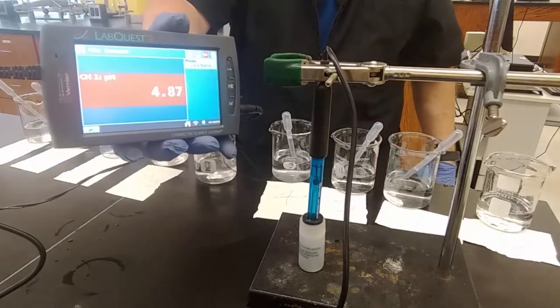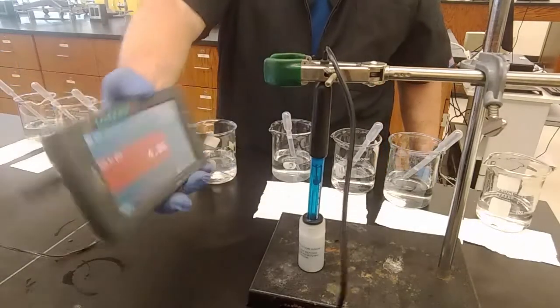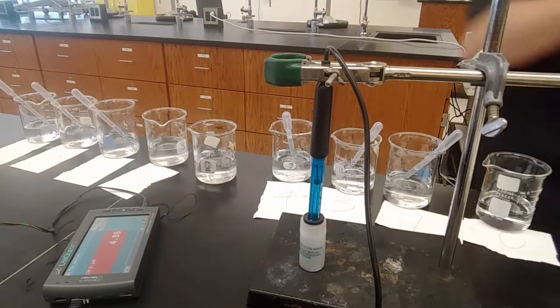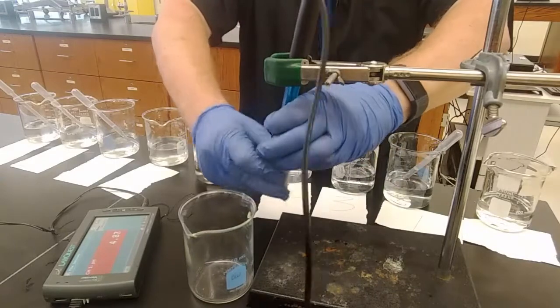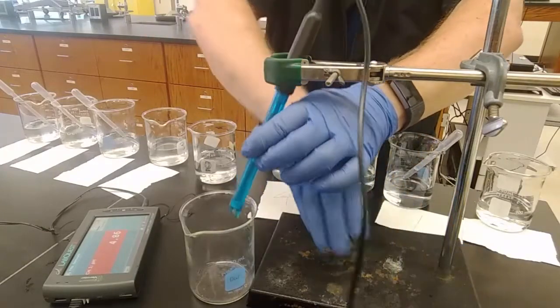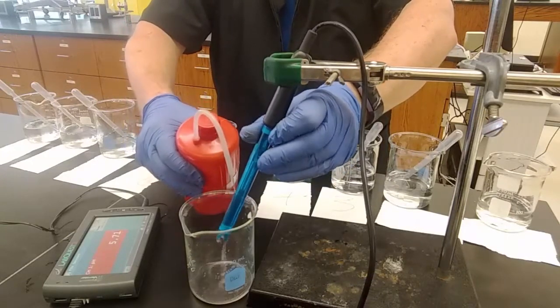and it's soaking in a buffered solution that should be around pH 4 or pH 7 or pH 10. This one appears to be near pH 4. But we will have a waste beaker nearby, so that we can rinse off this pH probe. Now the pH probe is very delicate, and we got to protect it by handling it carefully. It always has to be soaking in a solution, and so, for brief amounts of time it can be outside. But we're going to rinse it off with our deionized water in between every measurement.